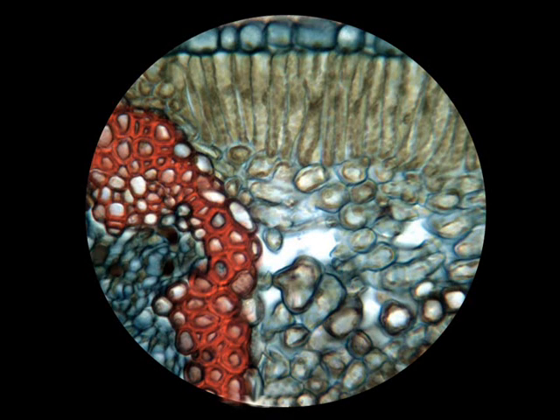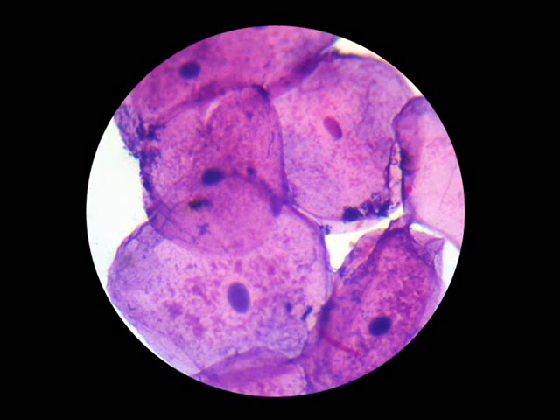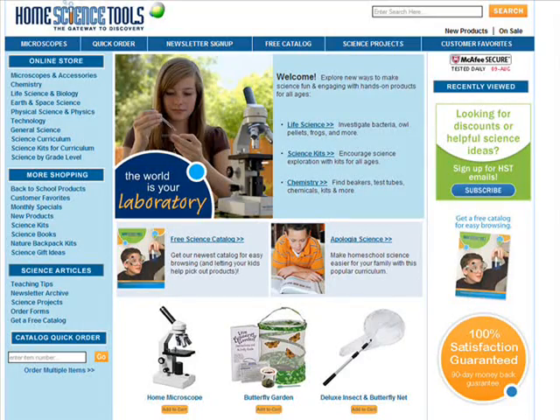These cameras have superb optical quality, are easy to set up and use, and are priced hundreds of dollars less than other digital microscope cameras with comparable quality and features. We guarantee you will be delighted with any one of these microscope cameras. See homesciencetools.com for full specifications.